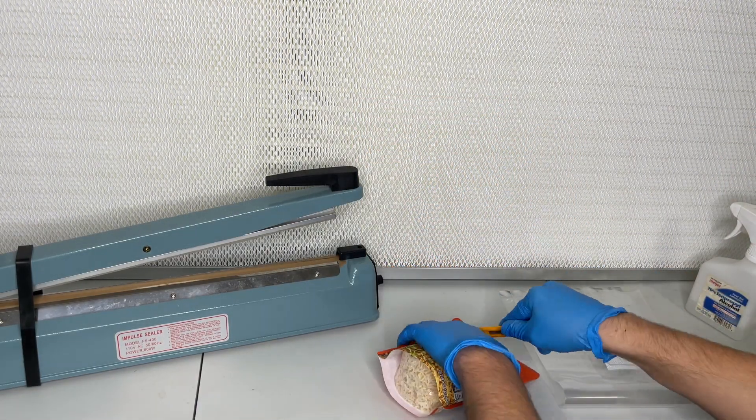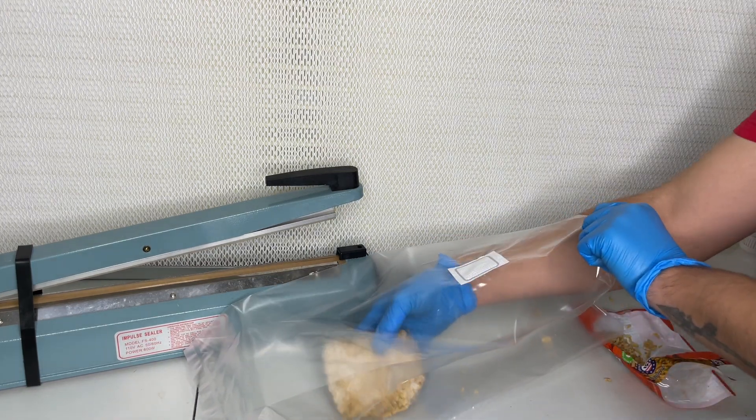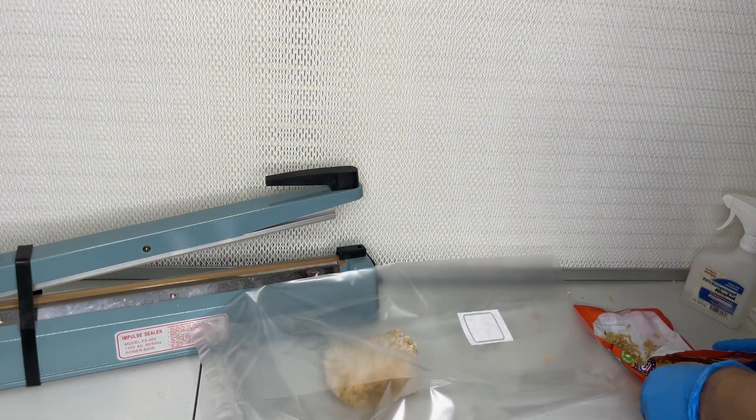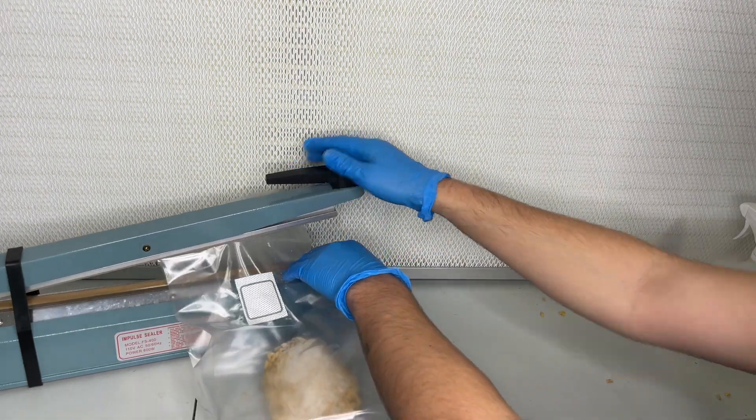After about 20 days of colonizing at 78 degrees Fahrenheit the rice cake is removed and placed inside of a filter patch bag. I use an impulse sealer to seal the bag.